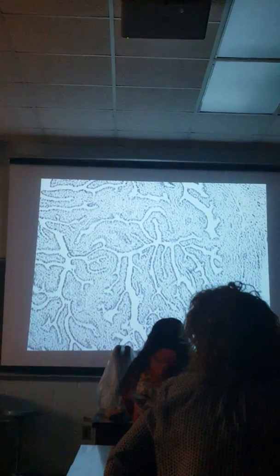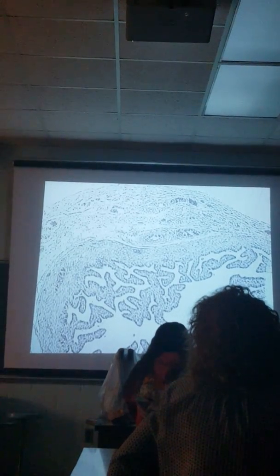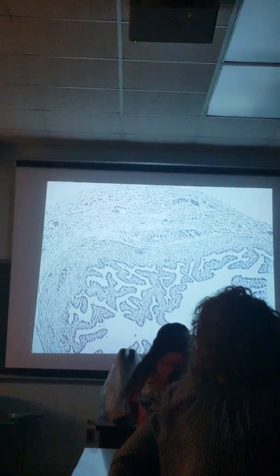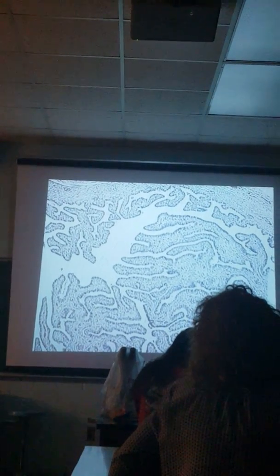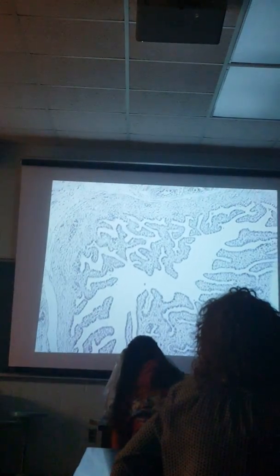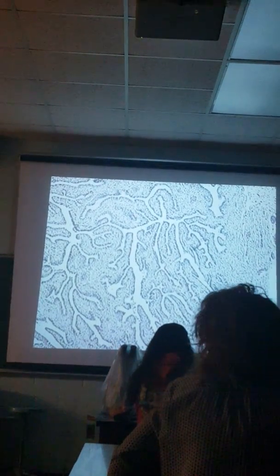So this is a cross section of the ampulla of the fallopian tube, or uterine tube. Sometimes it's called the uterine tube. The reason why we chose this one is just to show you the really complex structure, and also that this is likely the typical site of fertilization. So you can see it's a really distinct, crazy, contorted, maze-like structure. Okay, ampulla.